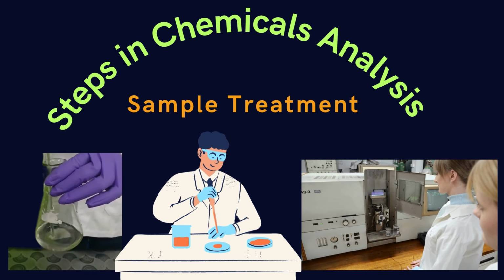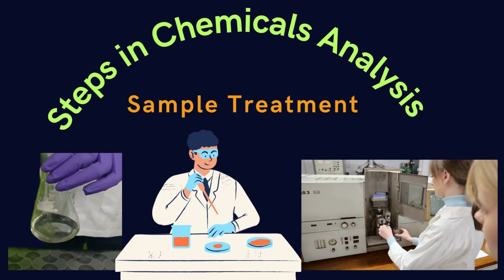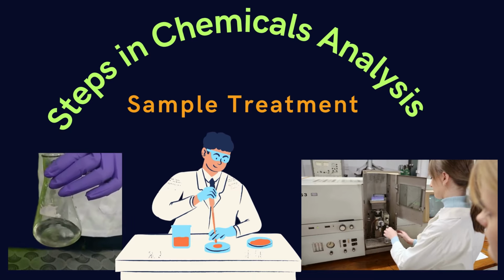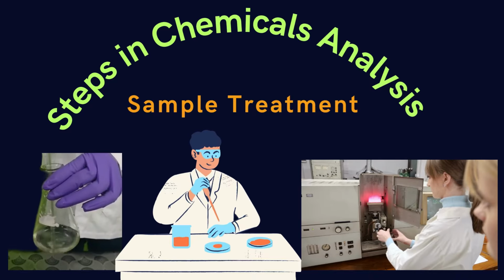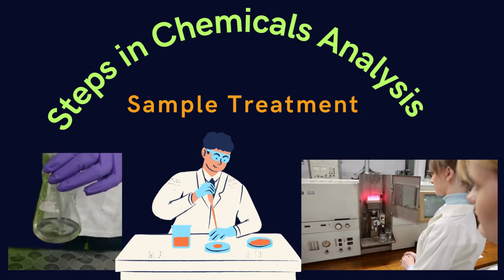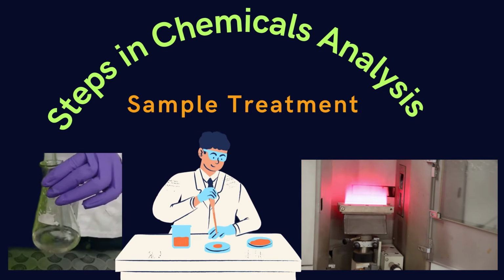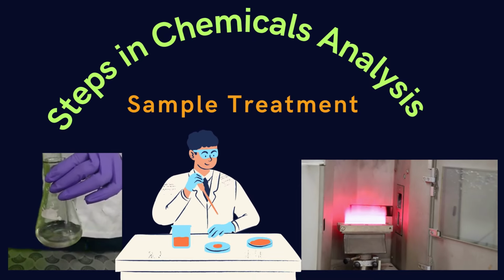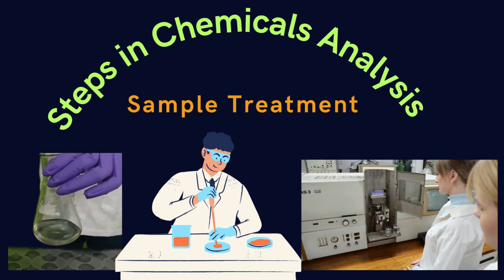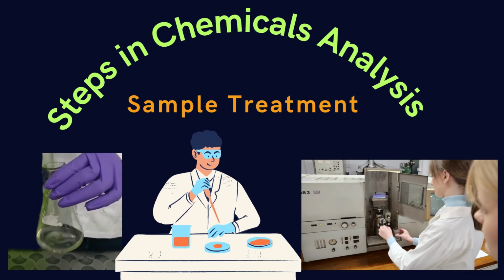Thus, in summary, this lecture outlines essential steps of chemical analysis, where the sample treatment results in the measurable form of chemical substances prior to instrumental analysis. It is highly useful for students doing dissertation or research work, as well as chemists working in industries and testing laboratories. The content strengthens understanding of accurate sample preparation and analysis of environmental, food, and clinical samples.